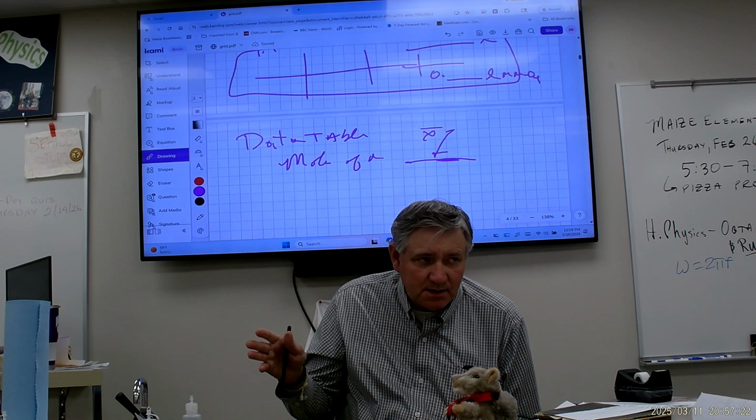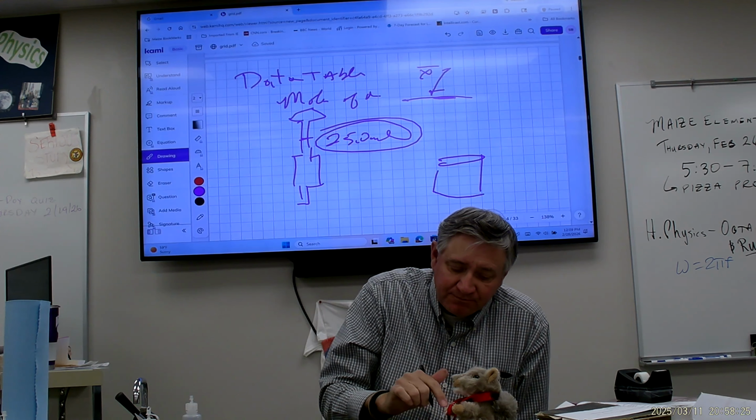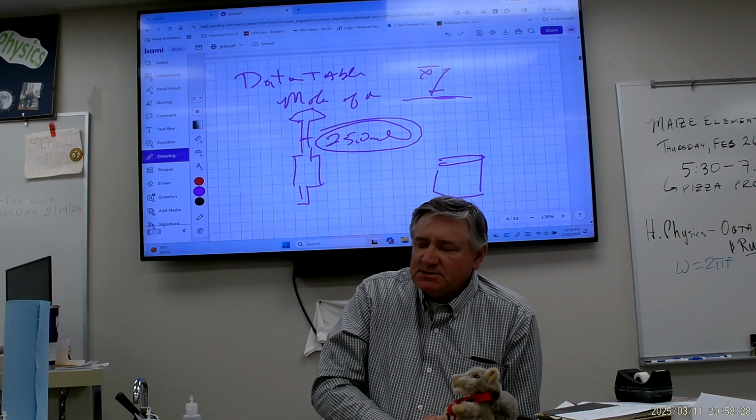Okay? Now, you need to add, and these are in little dropper bottles up there on the table, this 1 molar MnSO4. What it does is act as a catalyst. So we'll talk about catalysts later. So what a catalyst does is imagine that you're dealing with some second graders, God forbid. Okay?